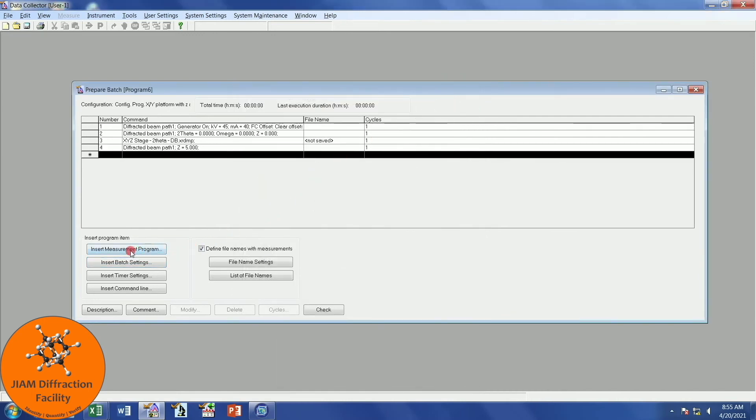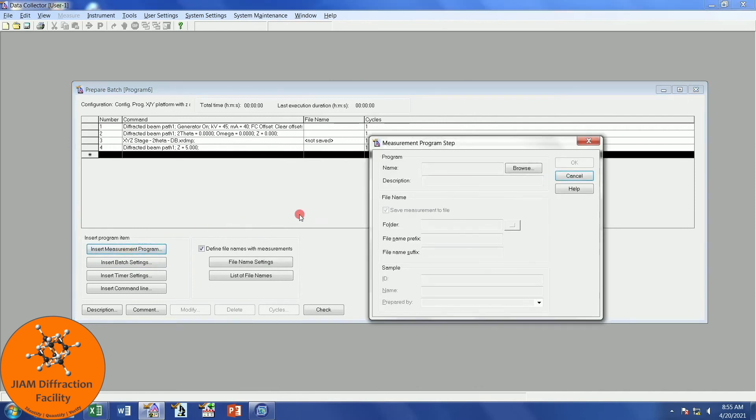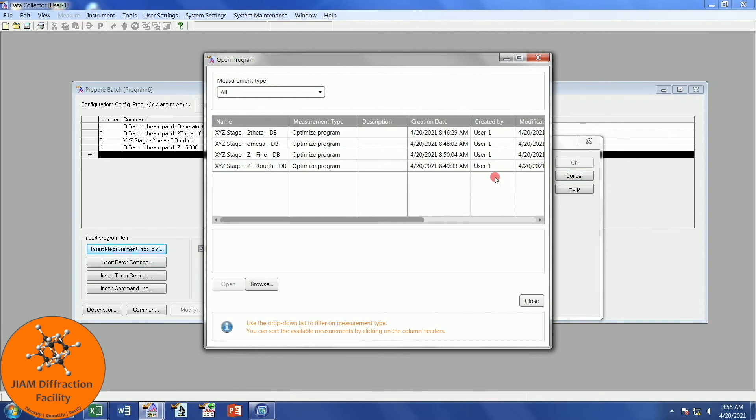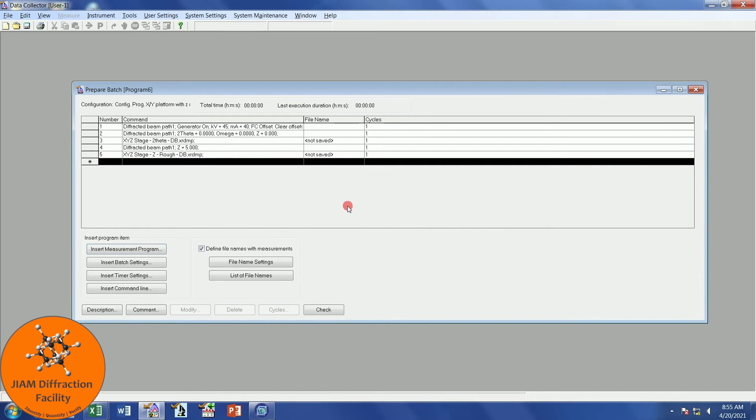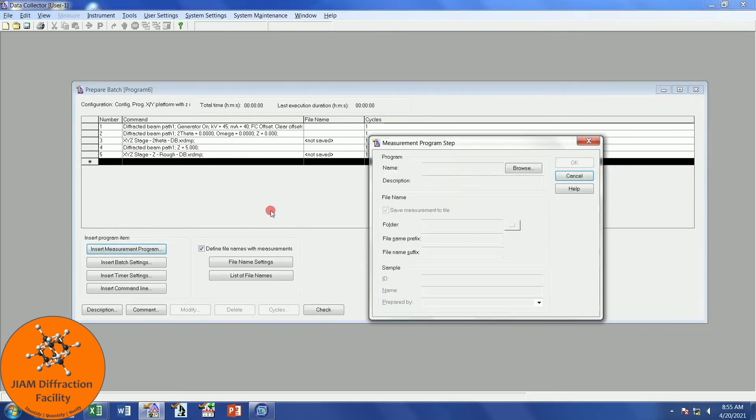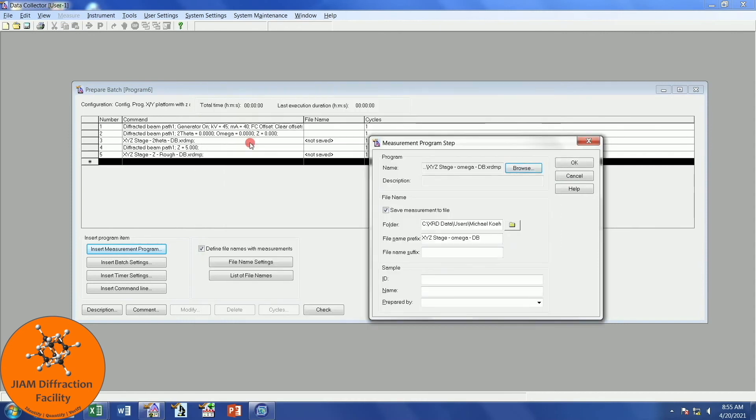Now we are ready to insert another measurement program. We will browse, and this time, we will do the rough Z alignment. I will uncheck Save and click OK. Next, we will insert another measurement program. Go to Browse. We want to perform our Omega alignment. I will double-click, uncheck, and OK.